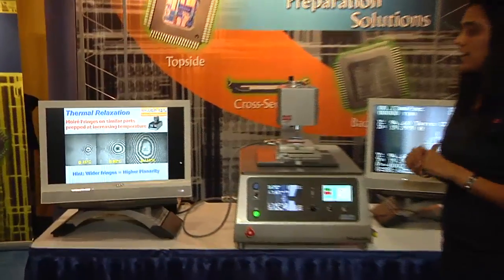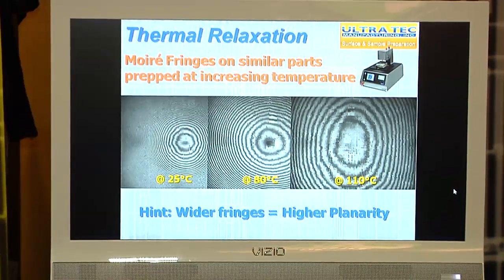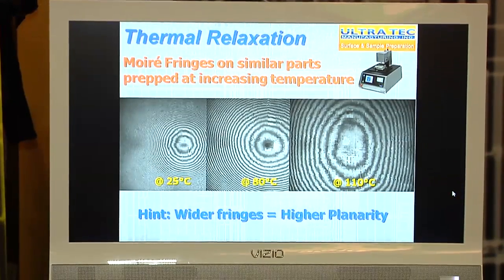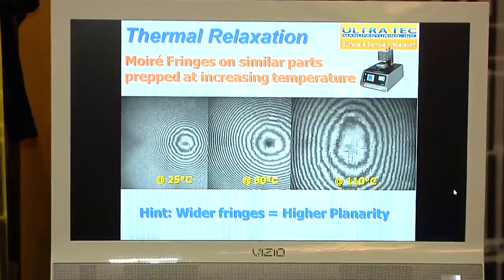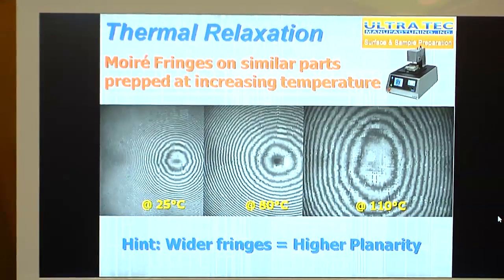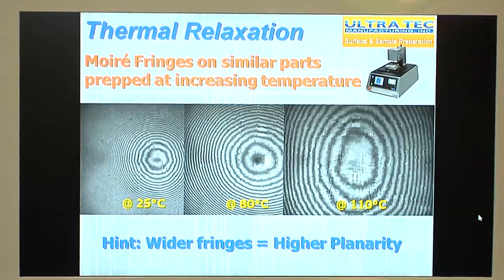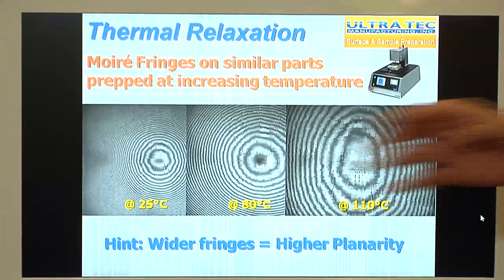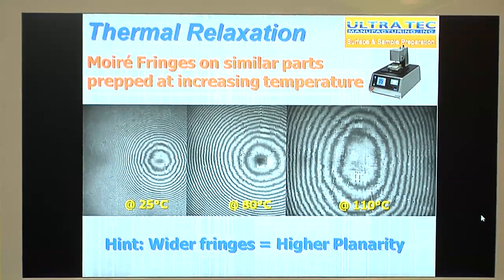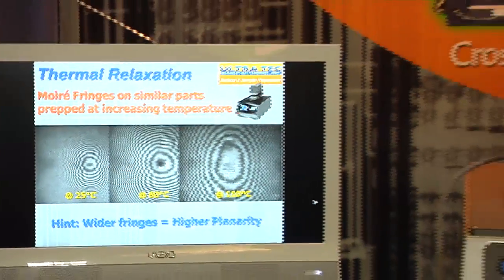Here we can see a fringe pattern showing the capabilities of getting a planar sample. We prep a part at 25°C — ambient temperature — and then increase the temperature. Three samples were done, one at each temperature. Wider fringes mean higher planarity, so going from the bullseye pattern, as the fringes get wider the sample gets more planar. At 80°C they get a little more planar, and at 110°C you can see a much wider fringe count, showing higher planarity at higher temperatures.